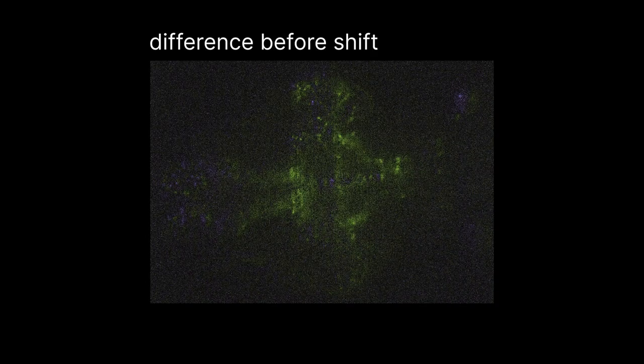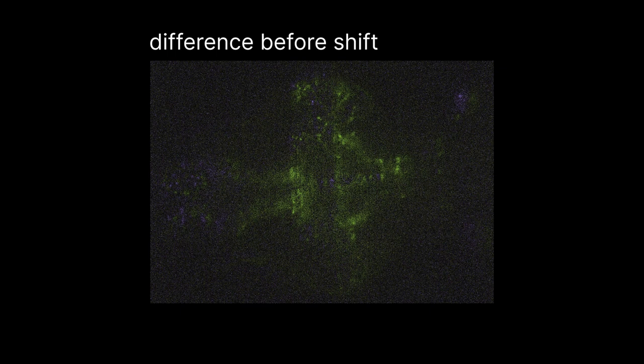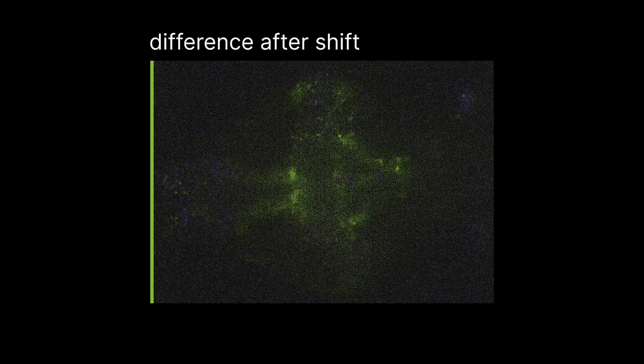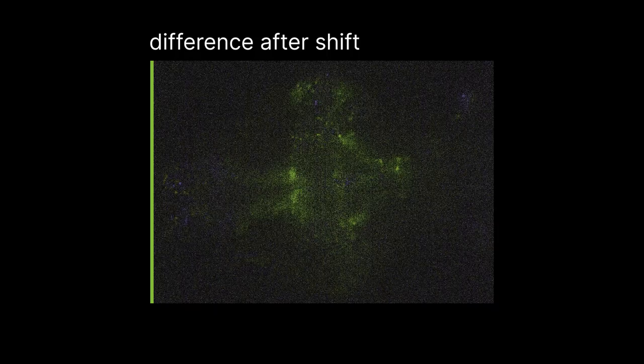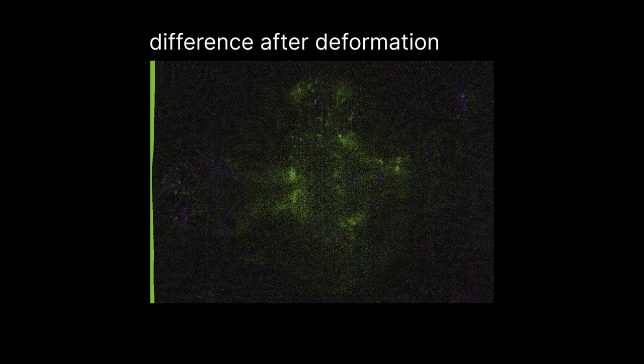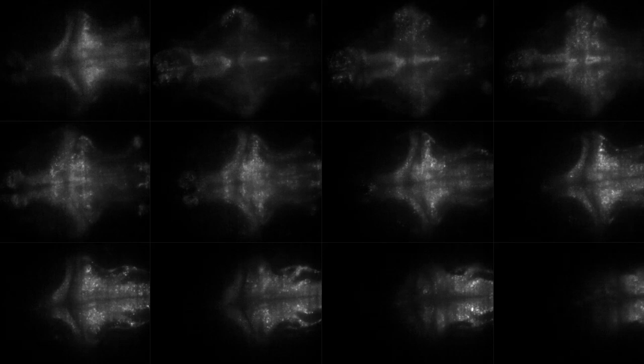Then, for each volume, finding a rigid shift via phase correlation, to find the optimal translation to correct rough motion displacements. And finally, splitting the volume into blocks, and finding optimal displacements for each of these blocks, and constructing a deformation field that accounts for distortions that cannot be corrected by translation only.